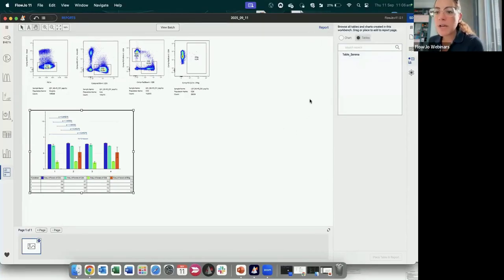Is it possible to export SVG files like FlowJo v11? Not in this version, but it's coming in next. Thank you. Same thing for Enrico. Can you also export in other formats? Not in v11.0, but coming in the next version. Okay.